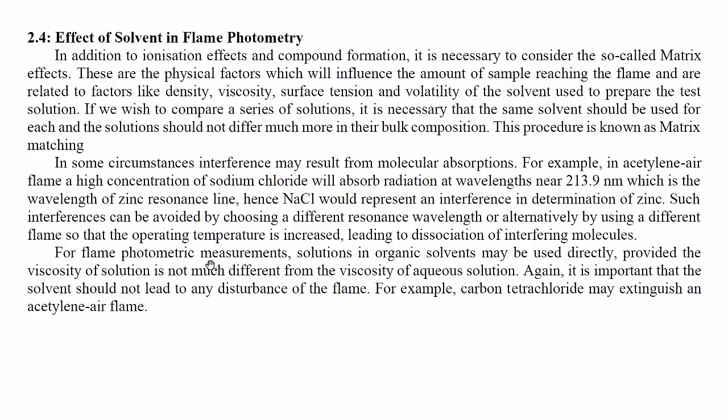For flame photometric measurements, solutions in organic solvents may be used directly, provided the viscosity of solution is not much different from the viscosity of aqueous solution. Again, it is important that the solvent should not lead to any disturbance of the flame. For example, carbon tetrachloride may extinguish an acetylene air flame.